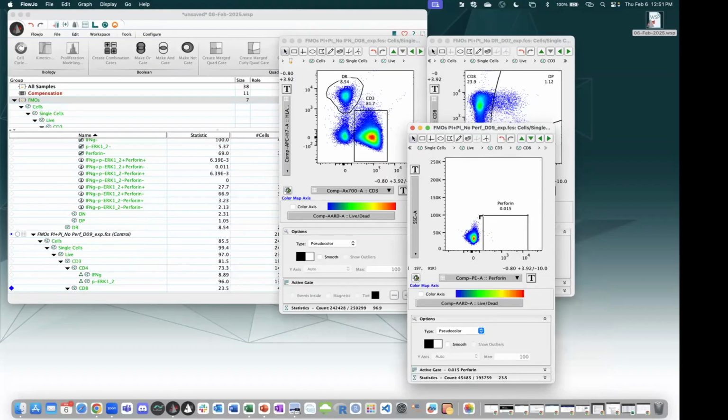So now that they are good, I want to close all my graph windows in one go. I can just go in the File menu, close all graph windows, or learn the shortcut, which on Mac is the Apple key, Shift and W. On PC, you will find this File function on top of any graph window, and the shortcut is mentioned there as well. All right.